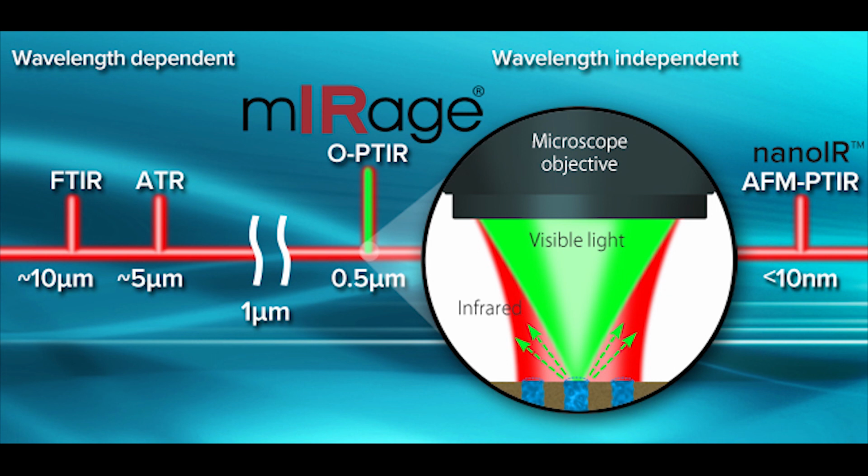Let's see, it says, can graphics of single wavelength monitoring be done within the standard software versus exporting data? So within our standard software, we have the ability to capture point spectra, capture single wavelength images like Kurt talked about, and collect these hyperspectral data arrays. And within our software, we have some set of analysis functions for the spectra and for creating single wavelength images from hyperspectral data arrays, or average spectra from a region of the sample. But we do additionally support exporting the data to third-party software packages.